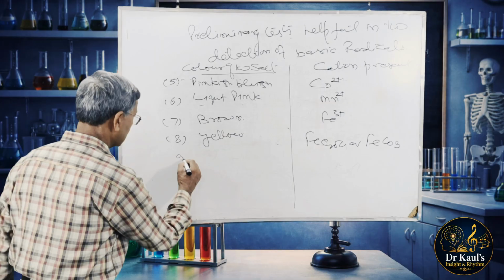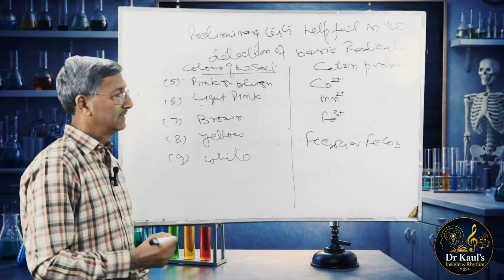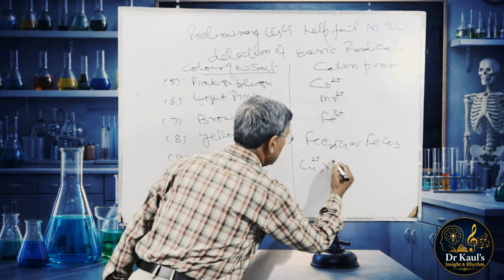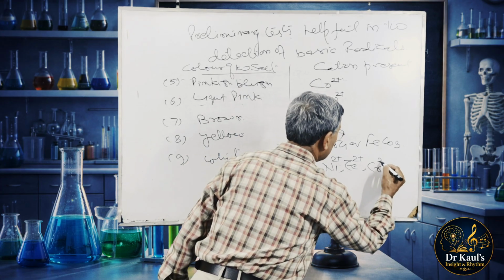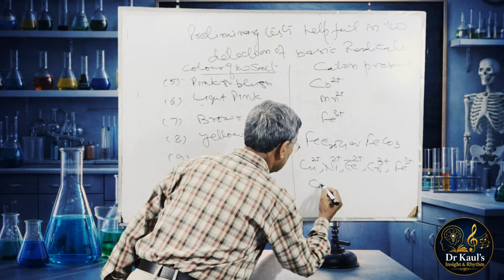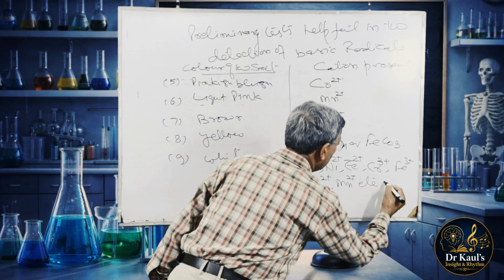And if the salt is white, that is no specific color, then these radicals, that is copper, nickel, ferrous, chromium, ferric, cobalt, manganese, etc. may be absent.